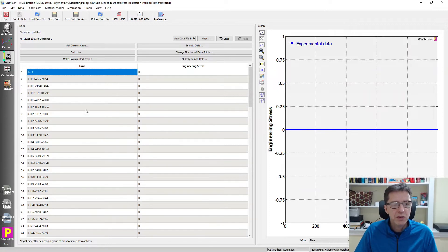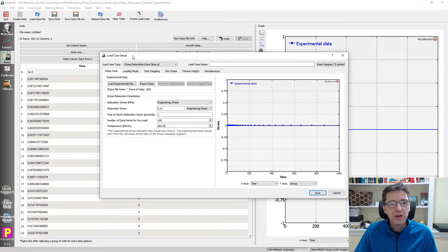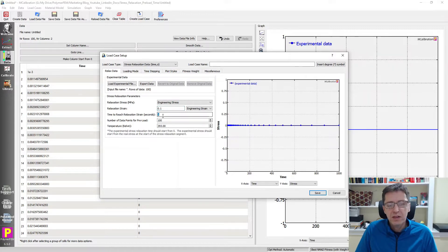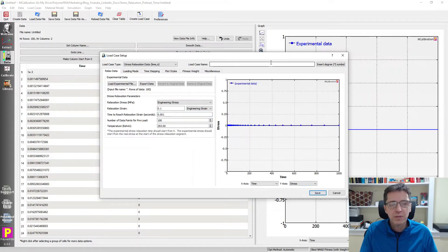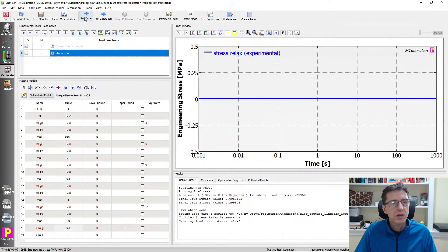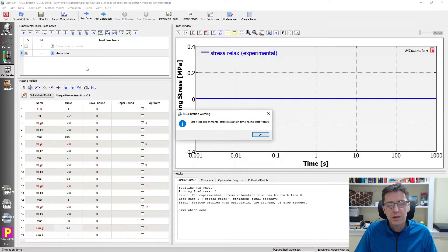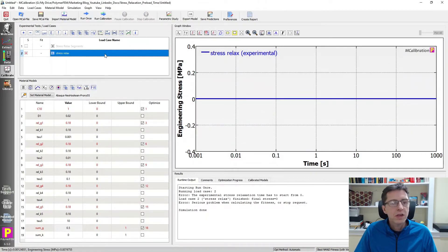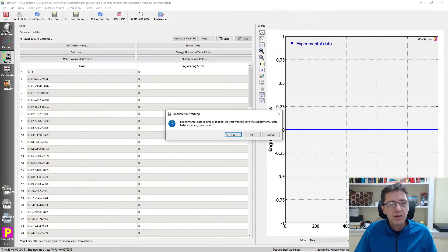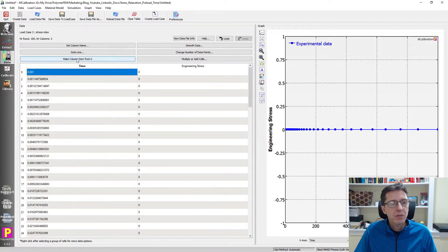I don't have data yet, but I can create the load case from this. If I click on that, MCalibration will automatically select the stress relaxation segment. I want to go to 10% strain. I have to specify the feature I'm interested in: how much does the preload time influence the results. I'm going to pick a small number here, then call this 'stress relax.' I run this one time and we have an error. A feature I forgot - I need to fix that. I need to make the time column start from zero, so time zero is where the start of the stress relaxation test occurs.